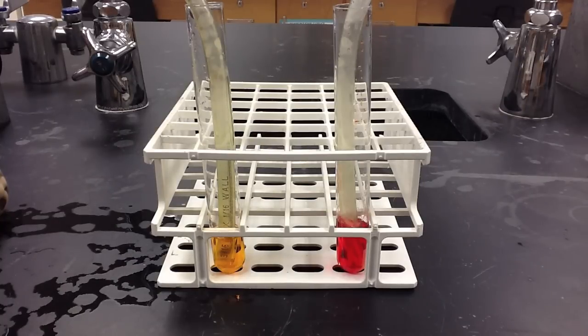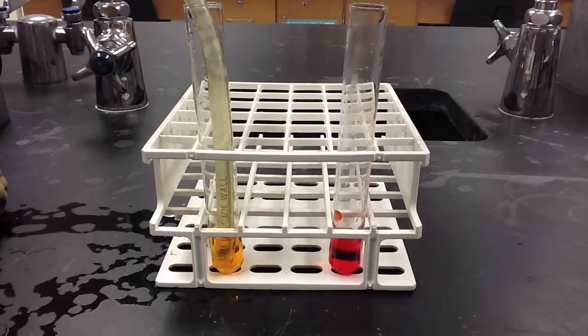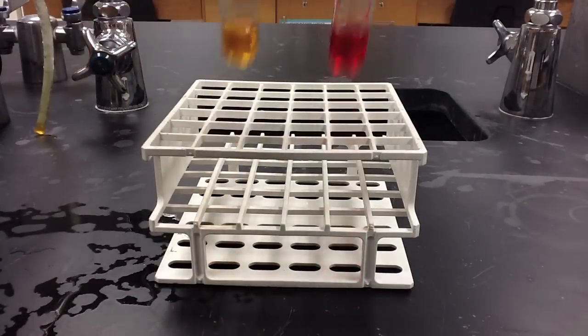I will now remove the rubber tubing from each of these test tubes and hold them up so that you can see the distinct difference between a positive and a negative result in terms of carbon dioxide production.